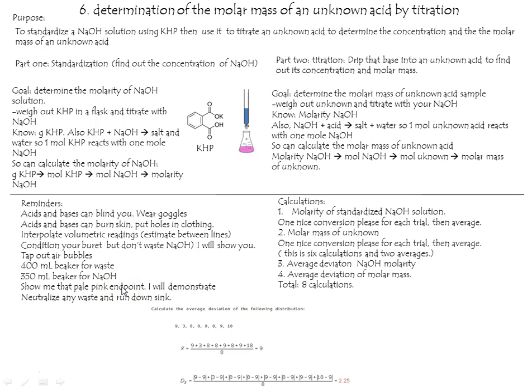Oh my God, you'll get super precise numbers. So that's always fun to shoot for. Any waste will run down the sink, but you need to neutralize it first. The general rule is if it's pink, it goes down the sink.